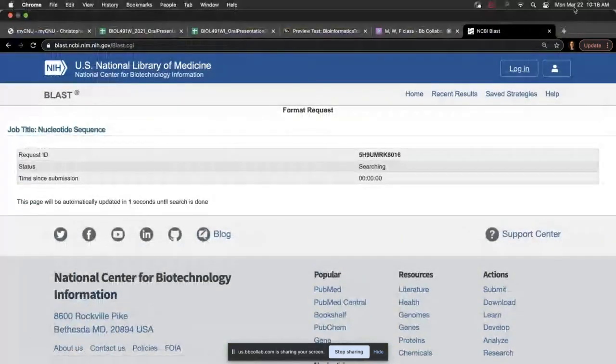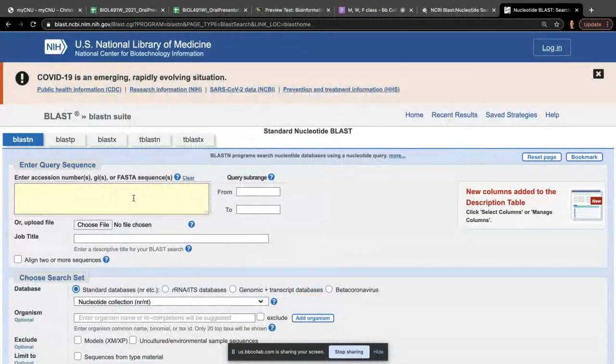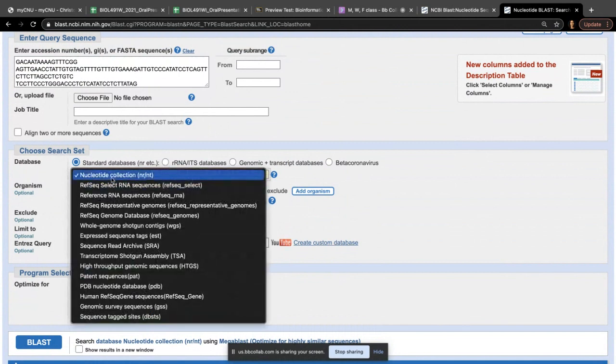You run that. While that is running, I also want to show you that I could have narrowed down my search, as in, okay, I'm looking for the book, not the movie, of whatever my query is. So let's say that there are many different items, all listed in here, but maybe my first results were not what I wanted. And I'm like, no, I only want something within this realm.